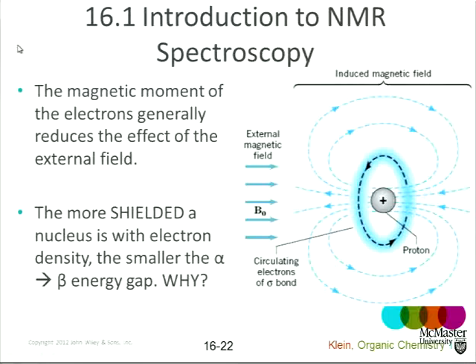This goes slightly sideways here. All right, so let's think about carbon nuclei. Carbon atoms in our chloropropanol, the methyl group, was at a low number of ppms. Does it have anything donating electrons or pulling electrons from it in the methyl group here? Not really, right? The carbon-carbon bond has no dipole. The carbon-hydrogen bonds have no dipole. That carbon is neither delta plus nor delta minus. It's not shielded, it's not de-shielded, so it comes close to 0 ppm. That was the peak on the far right.